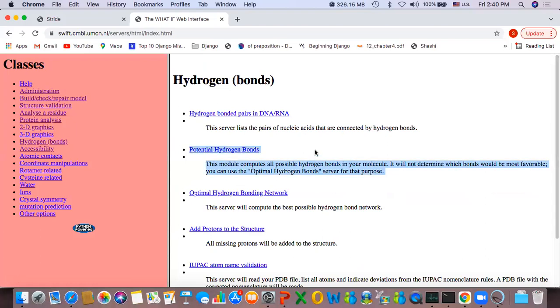I think, for every program you use, there is a little bit of variation in what is defined as a hydrogen bond. And this varies because typically you do not have hydrogens placed onto the structure. So many programs, for example DSSP, first place the hydrogens and then start finding all the hydrogen bonds. How you place hydrogen itself is a problem, so they use certain procedures in order to place hydrogens.